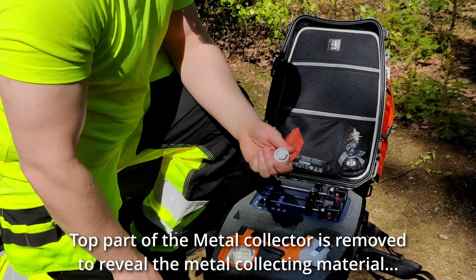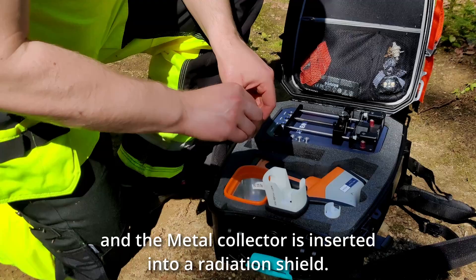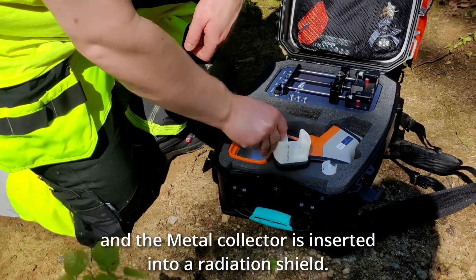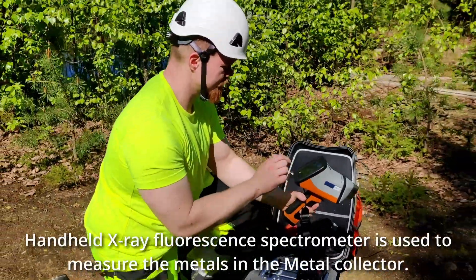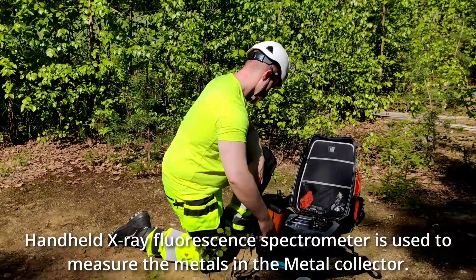The top part of the metal collector is removed to reveal the metal collecting material. The metal collector is inserted into a radiation shield. A handheld x-ray fluorescence spectrometer is used to measure the metals in the metal collector.